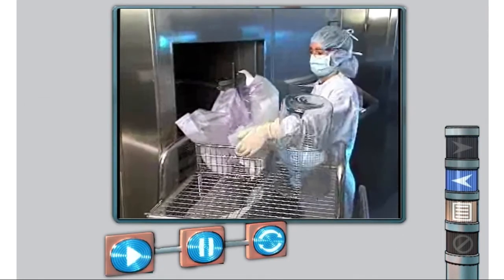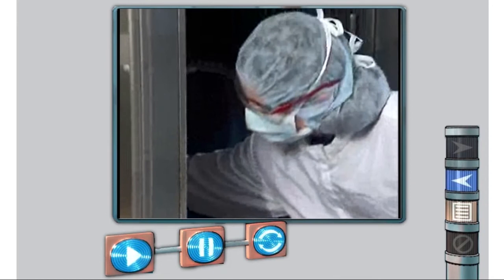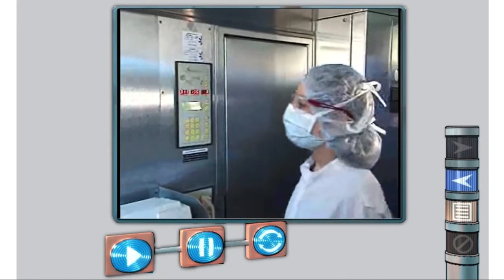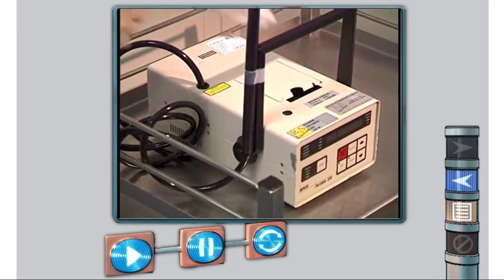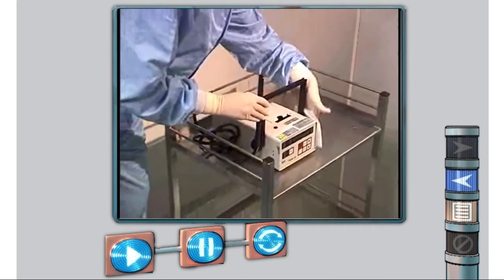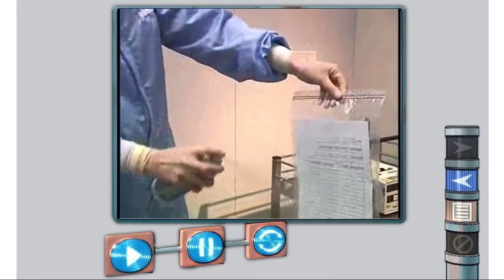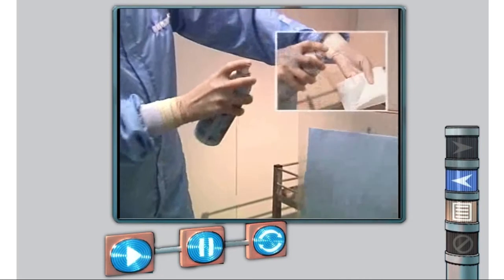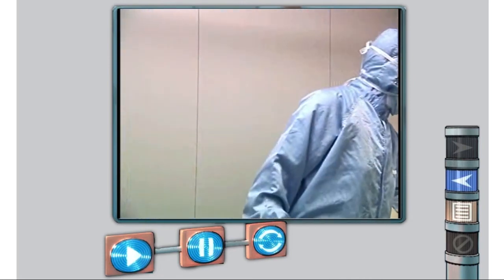To restrict the presence of microorganisms, materials used during production and testing of aseptic products are sterilized when possible. Sterilization will kill all microorganisms. Work materials which cannot be sterilized are disinfected. It may also be necessary to disinfect work materials during work. Follow the procedures carefully. These describe which type of cleaning agent you must use, what dosage is required, and how long the product must be allowed to take effect.